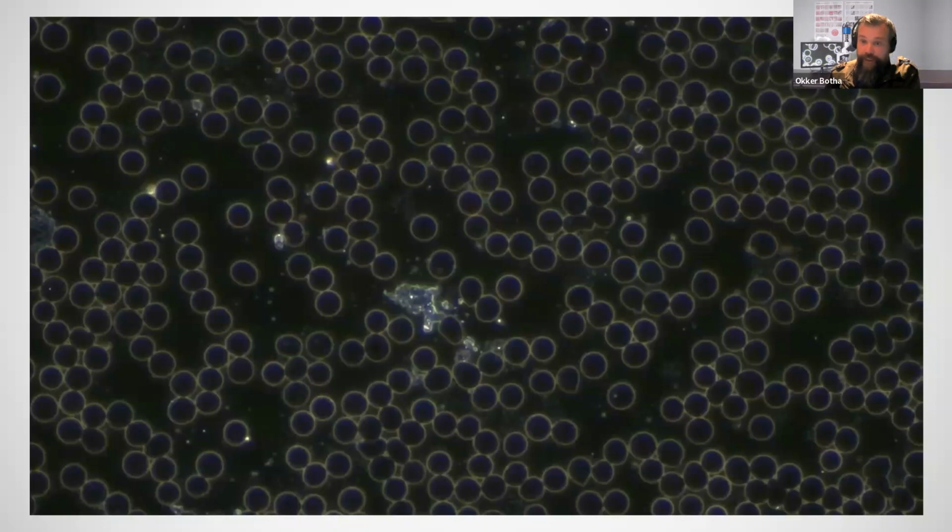Right, so another example of a dark field image that's not quite optimal. We're not really seeing the clarity and the contrast that we should be able to see. I hope it's becoming obvious what we actually want to see in a dark field sample. So here again, we're not really seeing much clarity. We can see some patterns between the cells, some structures that may be thrombocytes, some structures that may be lymphocytes or perhaps ghost cells. Again, lack of contrast, lack of clarity, and also the level of magnification. It's not quite at the level of magnification that we need for live blood analysis.